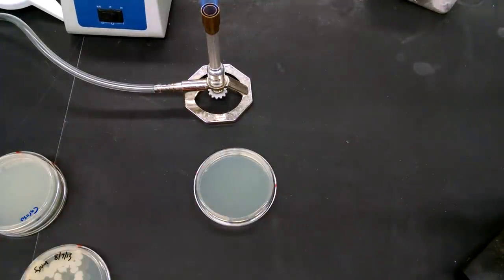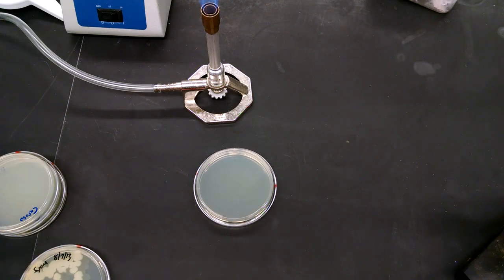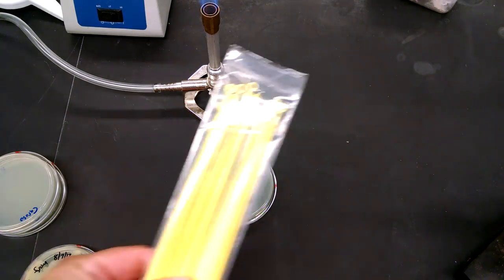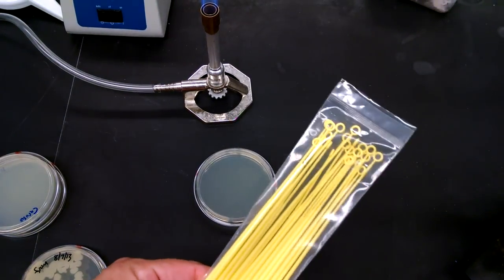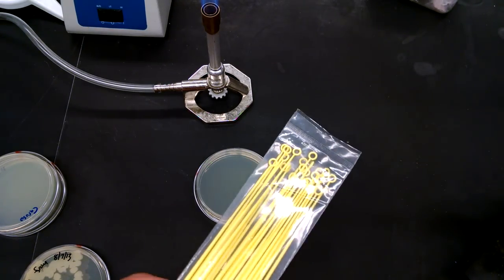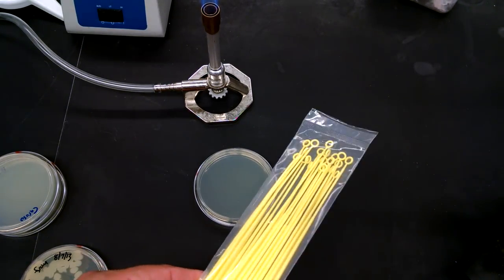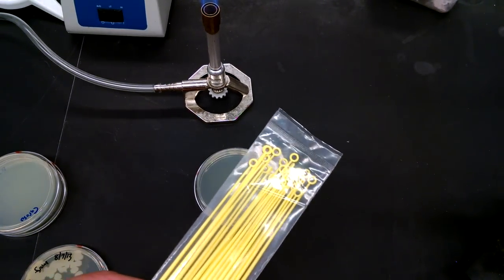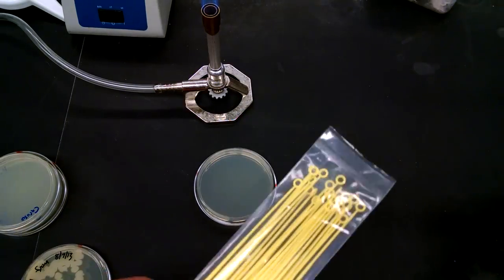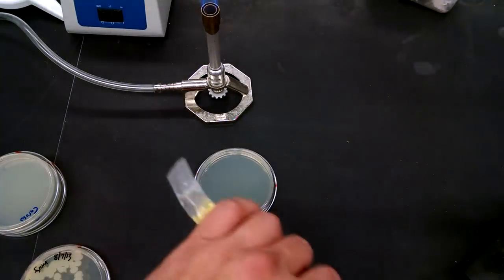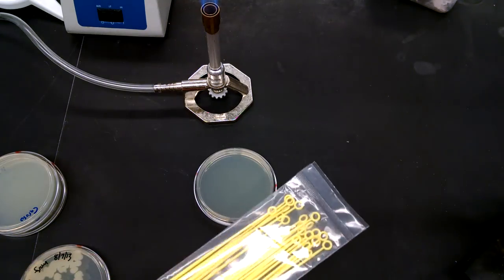Streaking a plate is really easy. What you need is something to streak with, and those are loops. We're going to use disposable loops. If you use a reusable loop, a titanium or steel loop, the procedure is only very slightly different. You flame the loop each time. With these disposable loops, they're sterile, they're in a bag. We're not going to flame them.